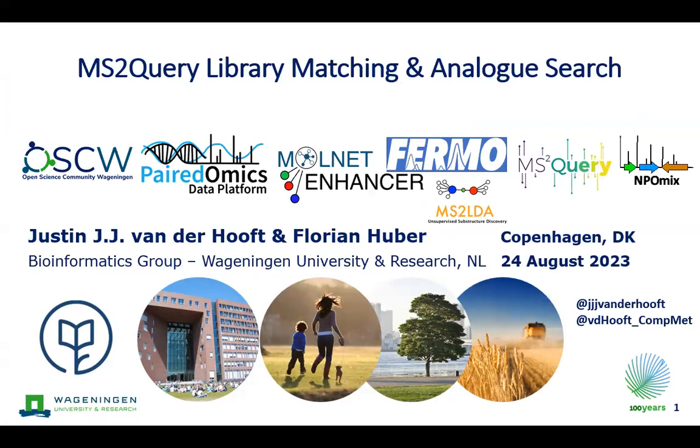Yes, so we will see what other tools we have going in this direction. I will briefly show you at least one example of how you could add more information to these dots. That's the idea. With the information we have now, we don't have a name. We already have unknown spectra. The only information we have is things like the percent. But of course, if we use MS2Query, which we're going to see here, or Sirius or other tools that add a bit of extra information, we could load it into this as well, so that we can have a name or a compound class or a SMILES on the MS. Briefly, I'll be showing this. It will be in a solution notebook, so you can do it yourselves. But I will show one example of it.